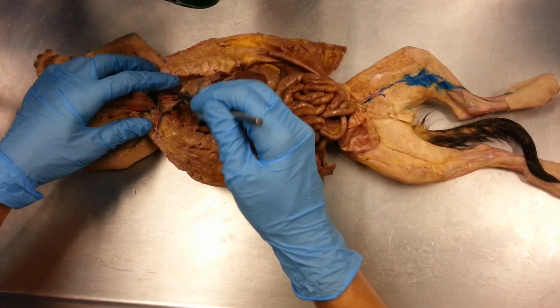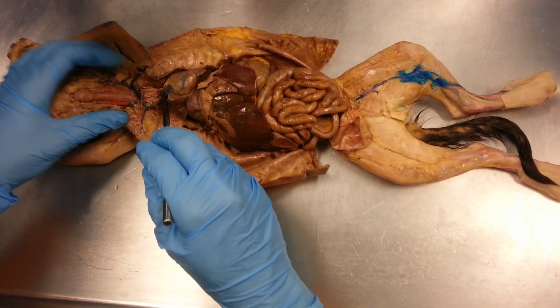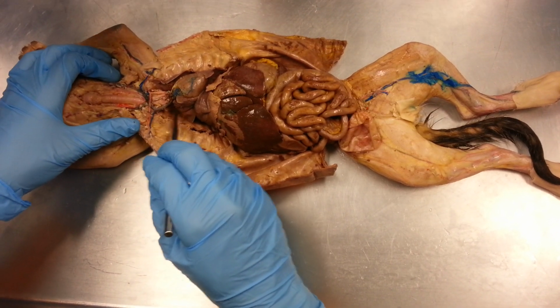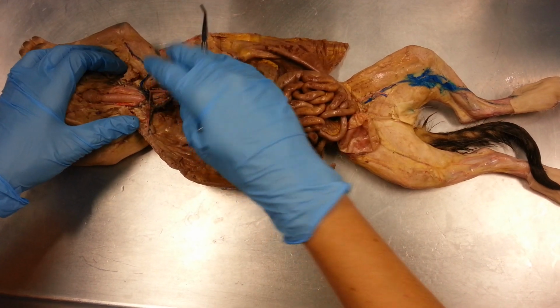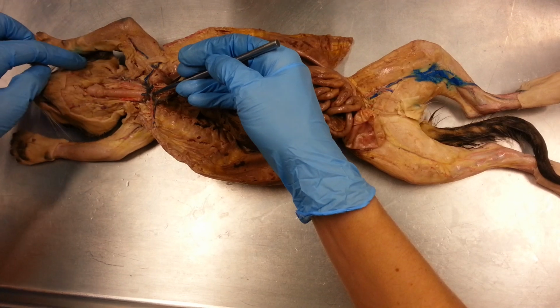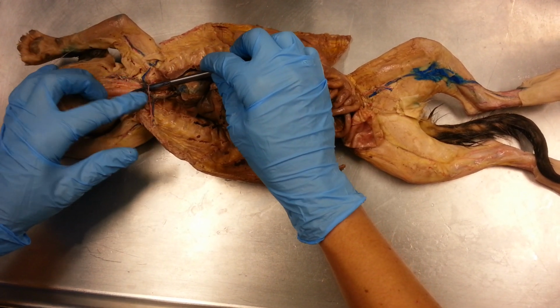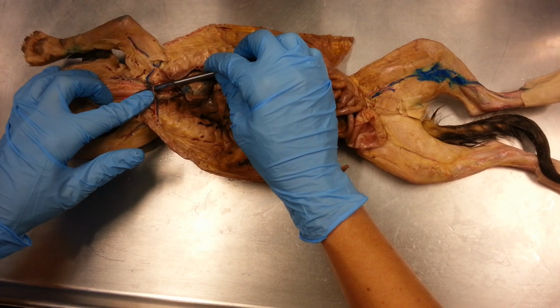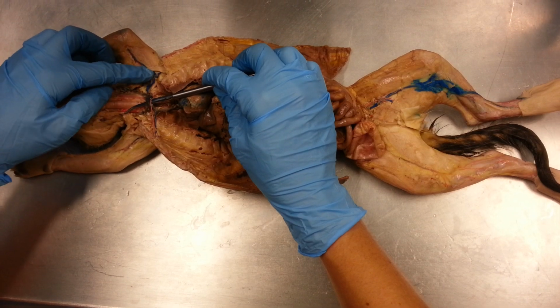If we come up from the heart, for both the aorta, which is here from the top of the heart, and the vena cava, it's going to split into the brachiocephalic veins and arteries. Okay, brachiocephalic meaning to the head and the arm. So if I put a pin here, you would know that this is the brachiocephalic vein because it's splitting up to my head and also over to my arm.